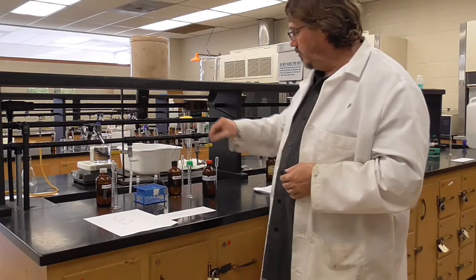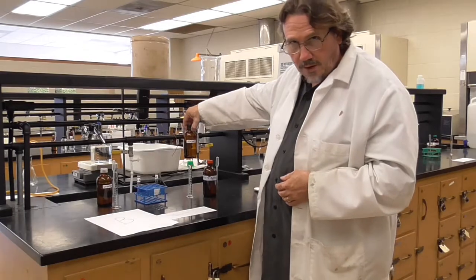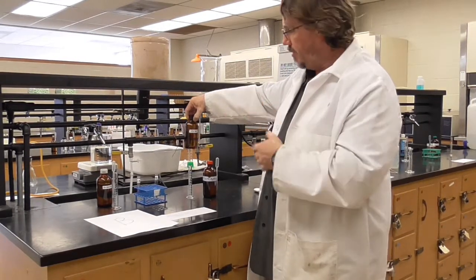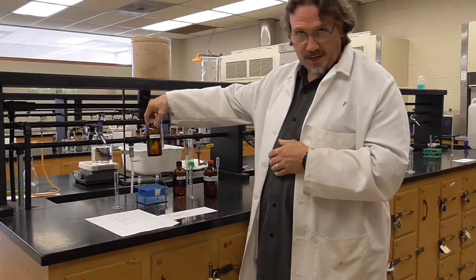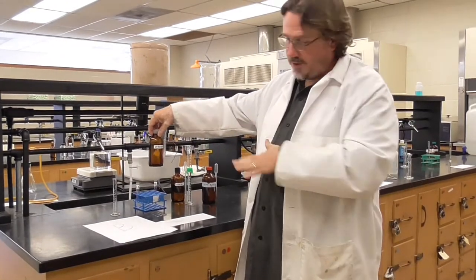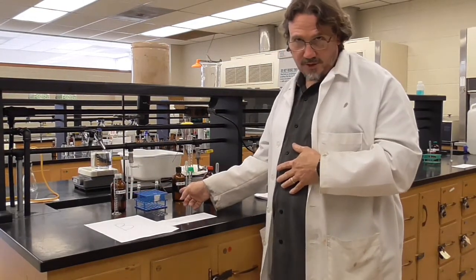For positive control we're going to use 10% sodium chloride. Quite clearly there are chlorides in this solution; we put sodium chloride in it on purpose. For the negative, we've got deionized water, so there's no chloride. It's just pure water. When we do this test, we'll see what the negative and a positive result look like.